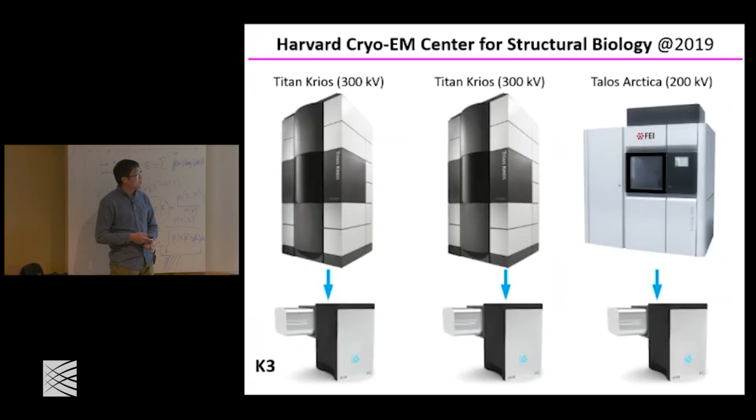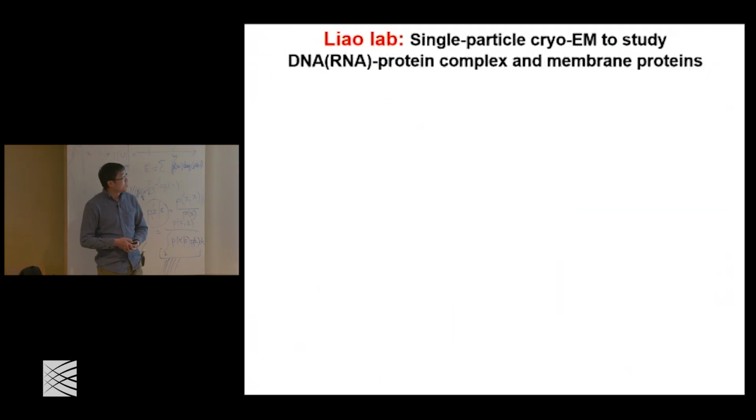And just this year, together with several other institutes, a new facility just started. It hosts two Titan Krios and one Talos Arctica, and all of them have the most updated K3 camera. So we are all very excited about this. Now I would like to tell you what we actually do at HMS.